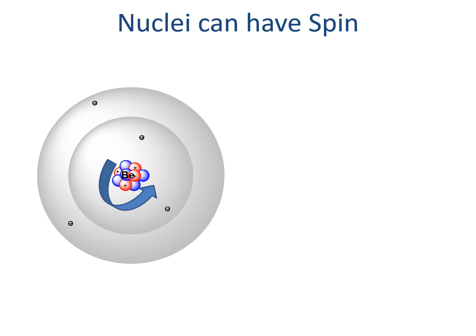You may not have thought about this before, but our nuclei for any given atom can actually spin in three-dimensional space. As it's spinning, depending on where the protons and neutrons are, it might actually generate a magnetic field and it will respond differently to magnetic fields as well. We can take advantage of this to learn a lot about molecules.